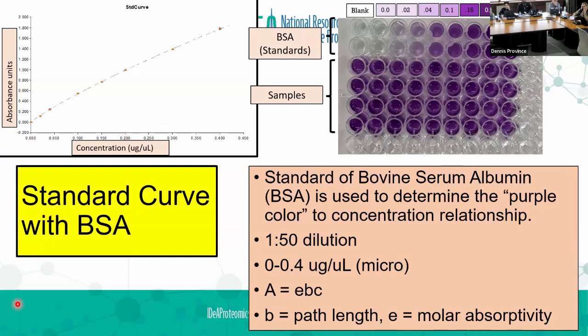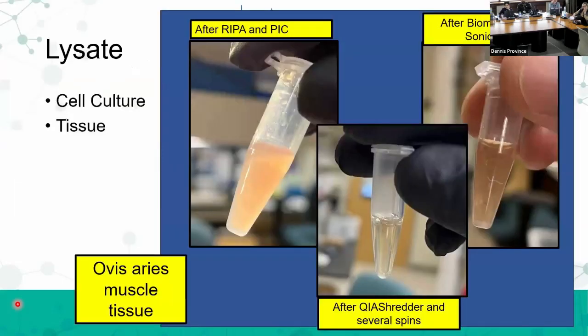But we're going to turn around and measure the protein quant of everything that you send us anyway, because there's just way too much work that we're going to do. We don't want to get all the way to Stephanie, who does the bioinformatics, and she goes, what in the world happened with this? And we go, well, the investigator from University X said this was the protein quant and we just rolled with it. You're not going to want to hear that when we give you your data and it looks bad. So anyway, that's what we do.